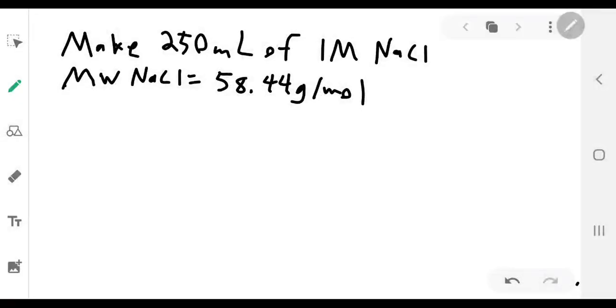Many times in the lab, even though you'll have stock concentrations that come directly from the manufacturer, sometimes instead you will have a solid, and you need to weigh that out and then dissolve it in whatever solvent you're using. A lot of times we know, because we have a protocol in front of us, what concentration we want, and often we'll make a large volume of it. We can usually dictate the volume, or maybe we're limited by the size of the bottle we have. Either way, what we know is the concentration and the volume we want. So we're assuming those things.